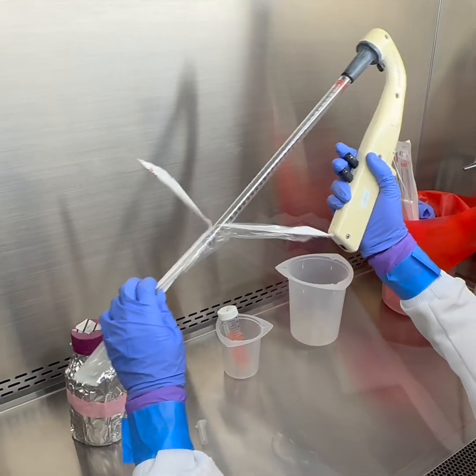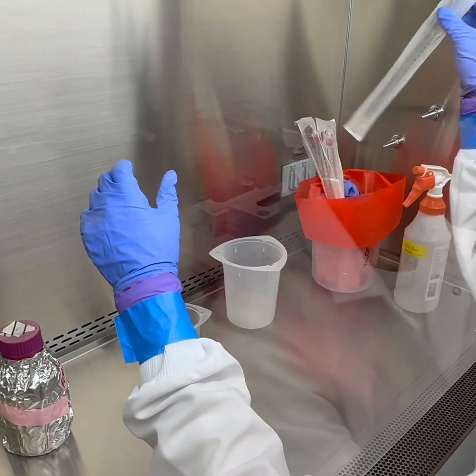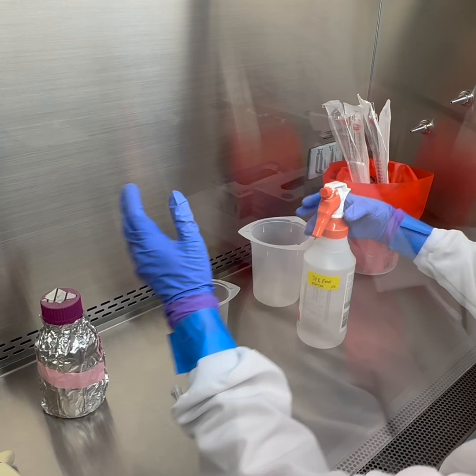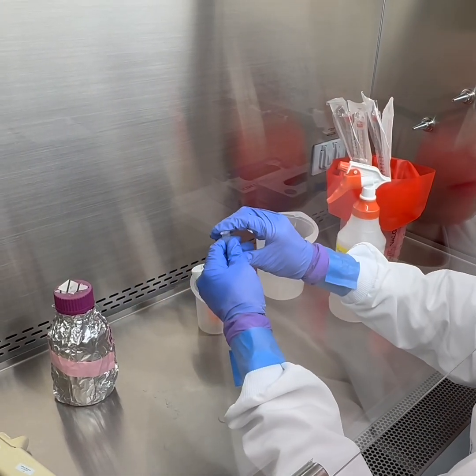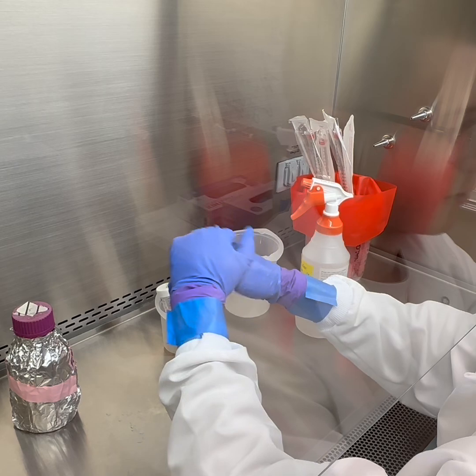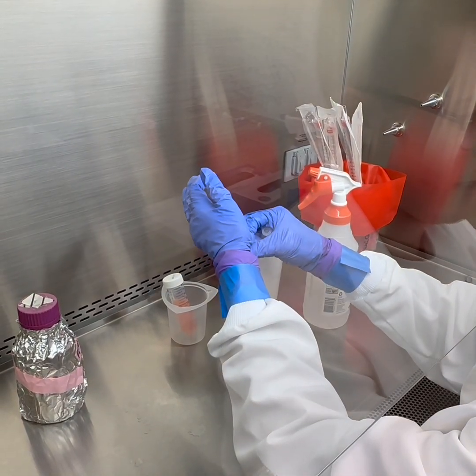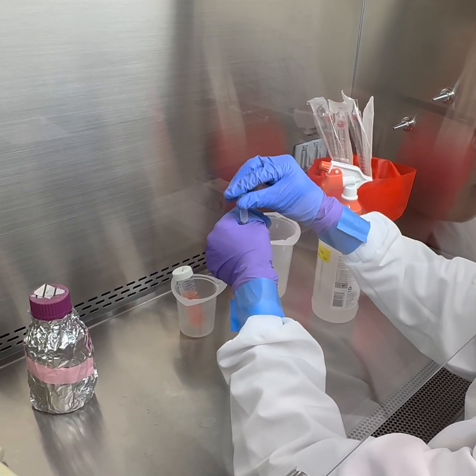To re-sleeve this. Going to spray this off, and you can either hand it out to an assistant or you can spray your gloves off and doff like this.